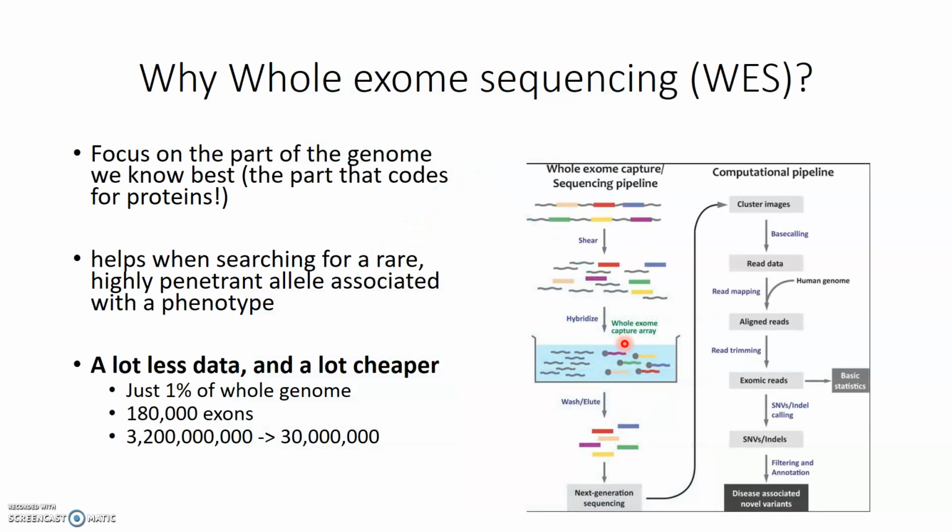And so we're looking at whole exome data, or we were before spring break and all of the pandemonium hit. You may be asking, why would we focus on the exome, or all of our exons? Remember, the exome in this case is all of the exons of the human genome, and exons are what are immediately translated into proteins.